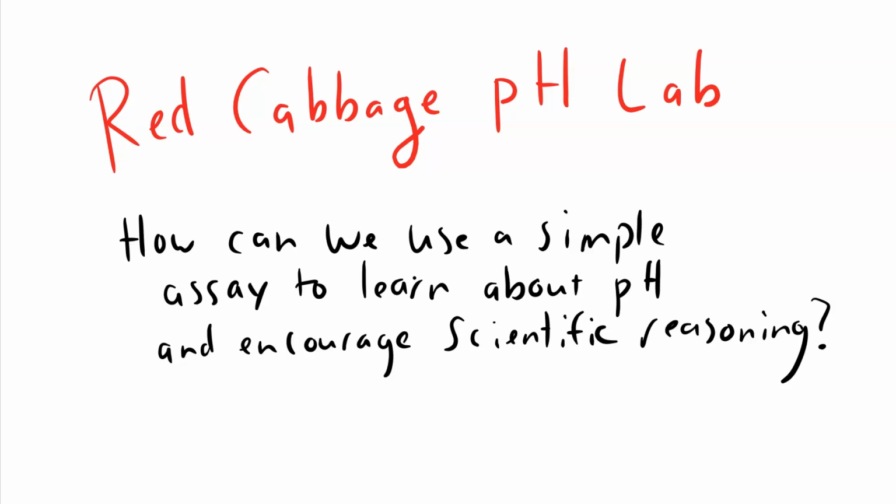Hi everyone, today we're going to do a pH lab. It's going to use the red cabbage indicator, which I'll describe in a minute. But basically this is a very simple experiment to learn about pH and to encourage scientific reasoning.